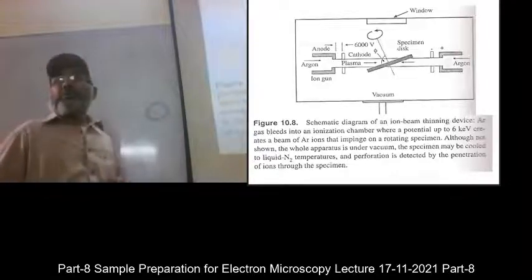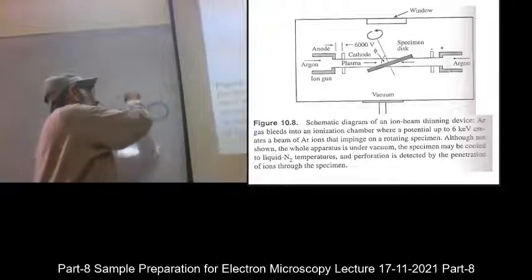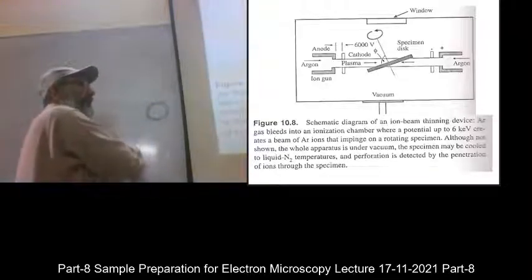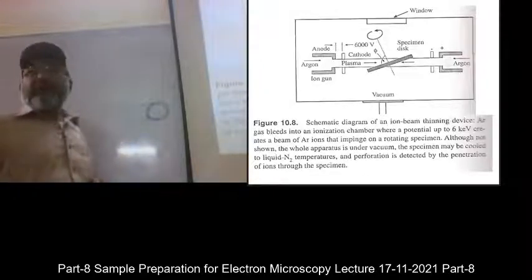electron microscopy. They have a thin wire in the sample holder here, and it is connected with liquid nitrogen. Into the liquid nitrogen.